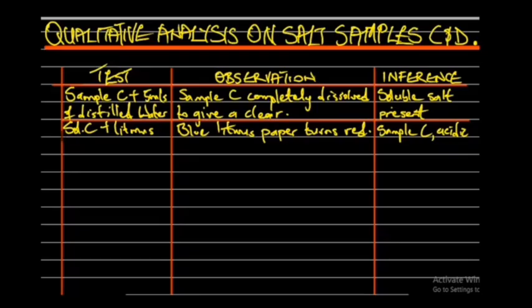Now let's go to the test proper. We chose to divide the solution of C into parts, so we'll be able to carry out a series of tests on them. Here's our first, here's our second, and here we have our third.